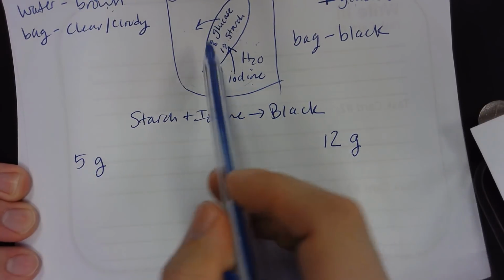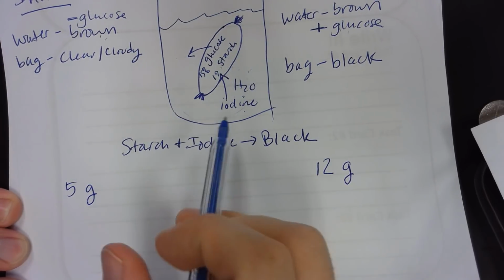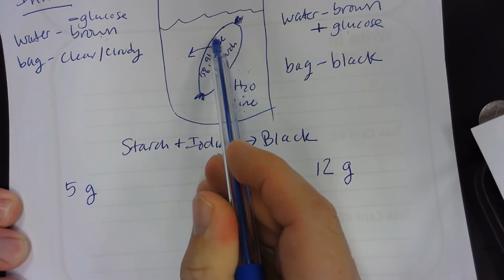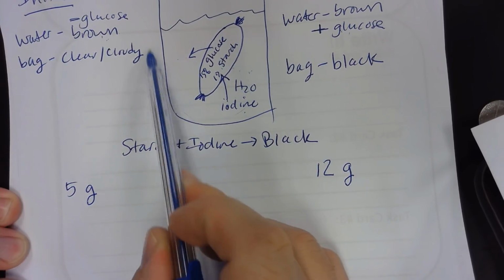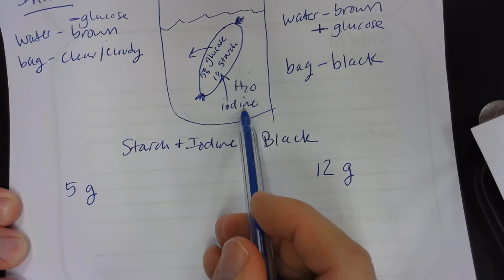Well, think about this. Inside the bag, we have all this glucose and all this starch. So talking just in terms of water potential, we have more solute, which means we have less water inside. Out here, we have a whole beaker full of water and very little substrate, very little particles or substances.